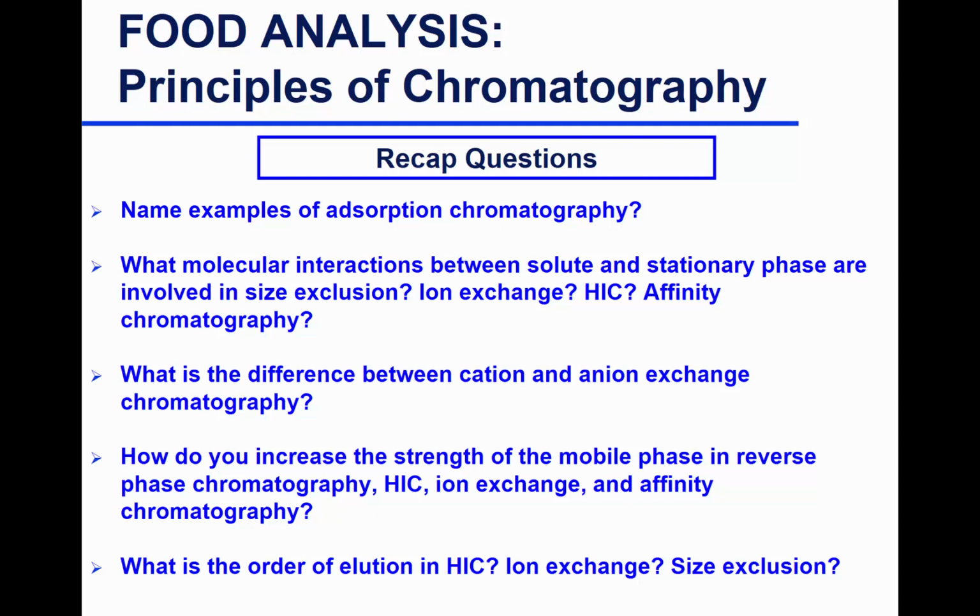How do you increase the strength of the mobile phase in reverse phase chromatography? First, you have to remember in reverse phase chromatography what would be your stationary phase and what would be your mobile phase.